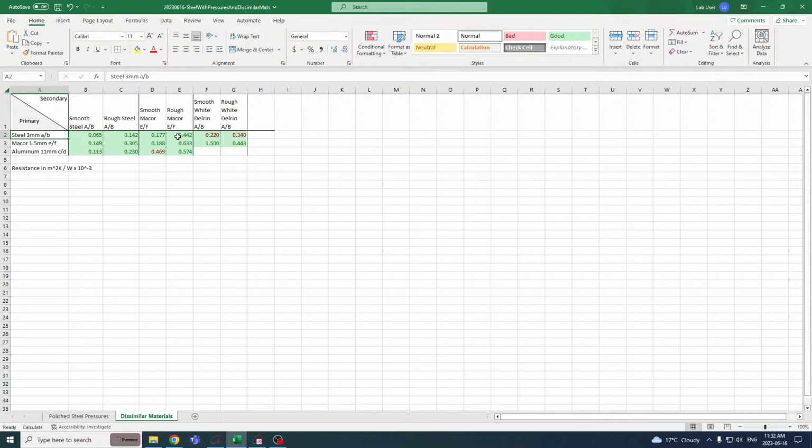And if you even look at the magnitude of change, obviously the intrinsic value of the material versus the surface roughness can make a difference. It's not necessarily always going to be the same percentage. Even if they're the exact same measured surface roughness, the thermal resistance can vary because of the hills and valleys created by the roughness and the intrinsic properties of the material that forms the hills. It's going to create different thermal resistance values between two materials.